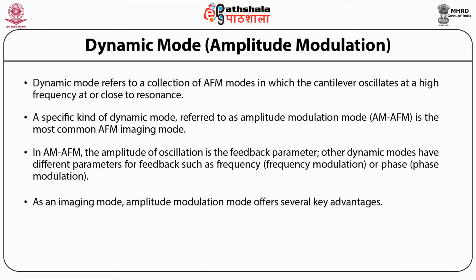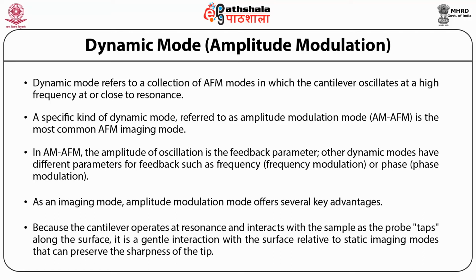As an imaging mode, amplitude modulation mode basically offers several key advantages because it operates at resonance, interacts with the sample as the probe taps along the surface. It is a gentle interaction with the surface relative to static imaging modes that preserves the sharpness of the tip.